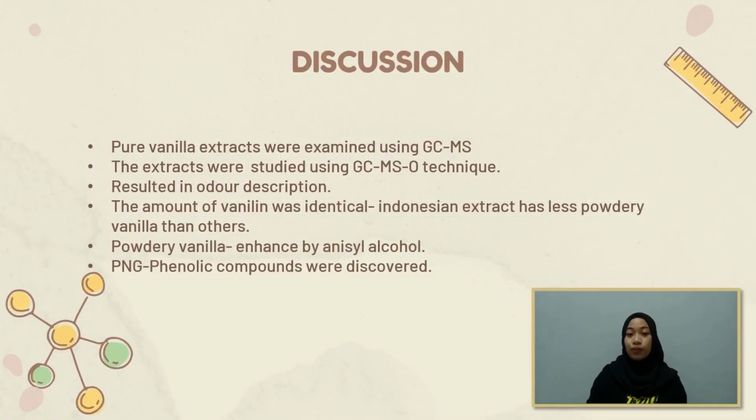Now, I will continue with the discussion. First thing first, pure vanilla extract was initially examined using gas chromatography-mass spectrometry, and then the same extract was studied using the gas chromatography-olfactometry technique. This method resulted in odor description by highly trained sensory scientists.